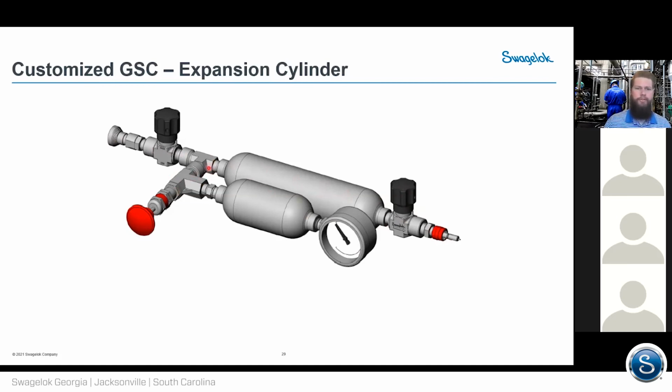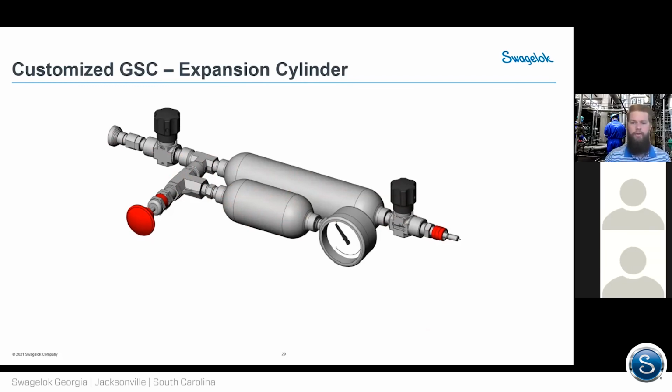And then we can also add this relief valve to allow you to continuously capture any sample that may have released out because the overpressure has opened up the relief valve. Put a little gauge on it so that if the relief valve has actually opened up, you have a visual indication that you might need to deal with that.